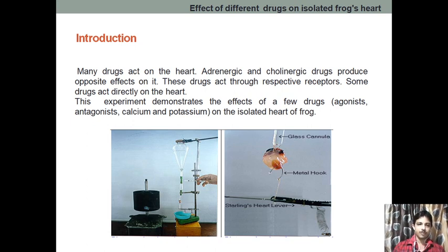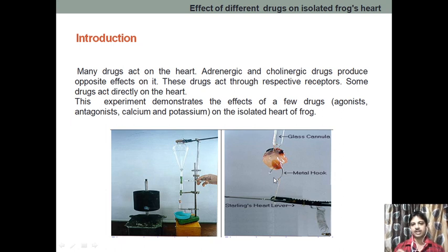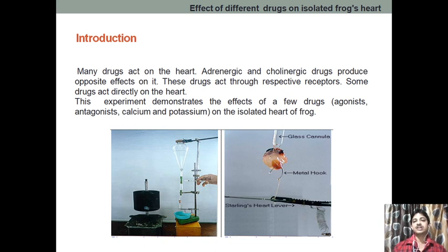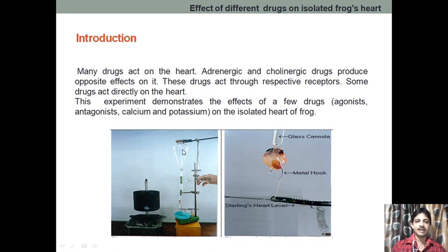Here, one important thing — this is the heart, and this is the cannula through which we are giving the physiological solution. It is important that after sacrificing and isolating the heart, we need to perform the experiments immediately, because after the death of the heart tissue, the drug will not respond. The glass cannula is inserted into the heart, and the physiological solution is supplied through the reservoir.